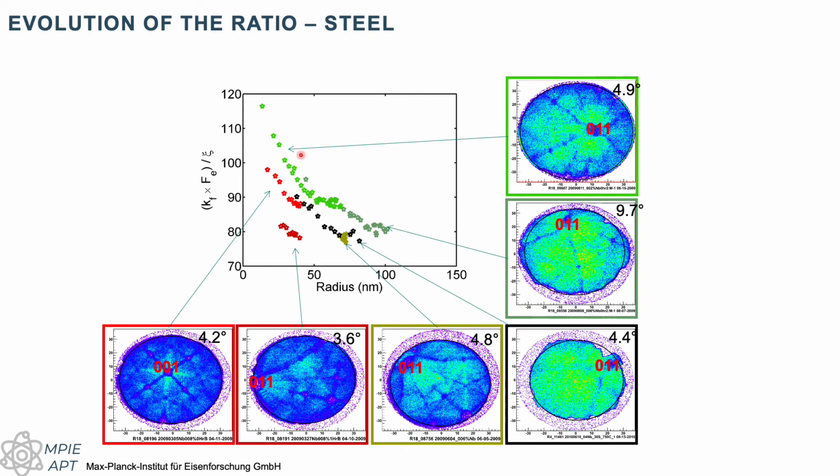And this is for different specimens from the high strength low alloyed steel, and again the shank angle doesn't change that much, but the orientation of the specimen plays a bit of a role. But it's really quite hard to find really specific trends.